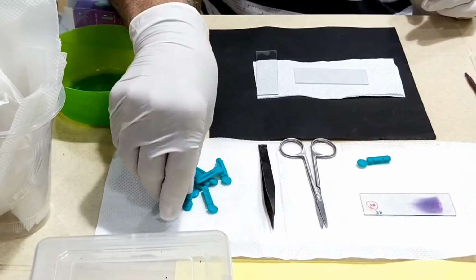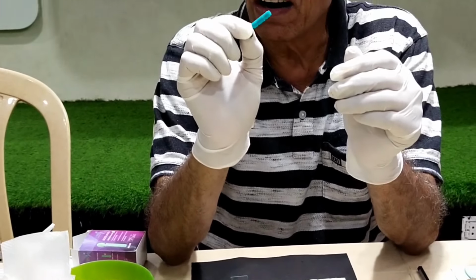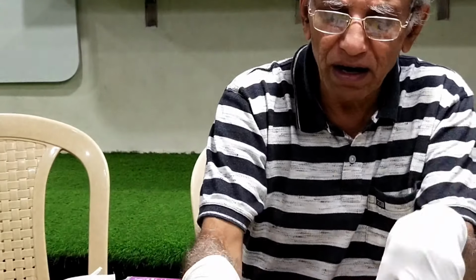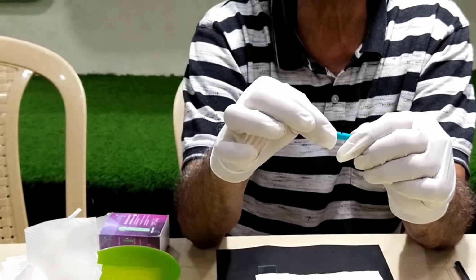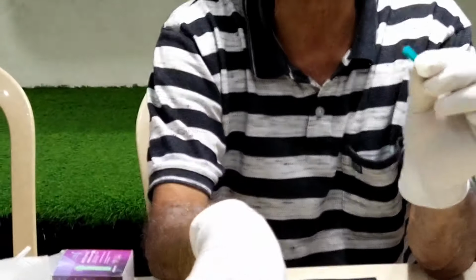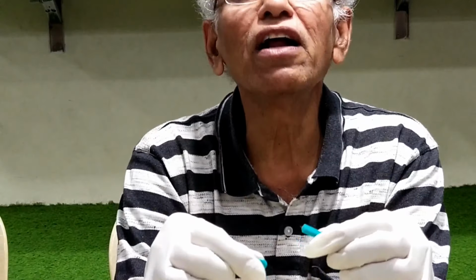It is a very fine tip, a needle which has been fitted here. I can show you. For example, I'm just pulling it. This is the one, very fine, and it is this one which can be used to puncture the finger to take out the drop of blood.